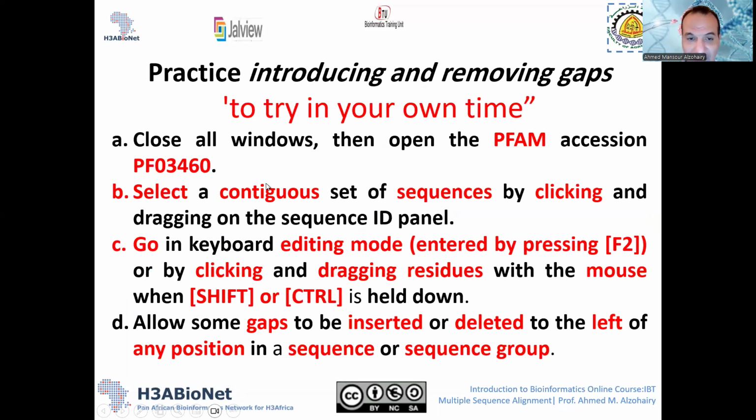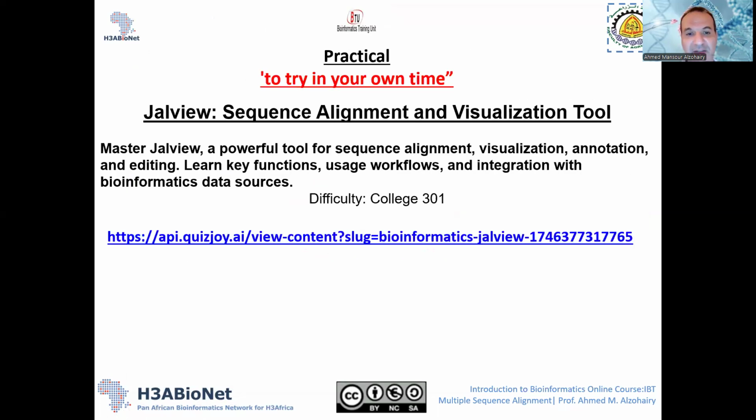This can be applied, and you can practice the same techniques as you can see from here, and also from this link. There are many questions about this visualization tool, Jalview. I hope you like it, and let's go to the next stage. Thank you very much for listening.